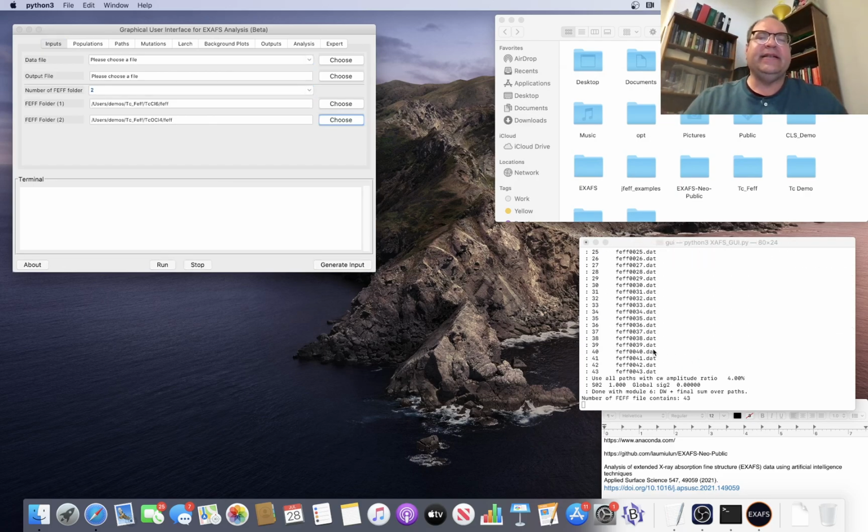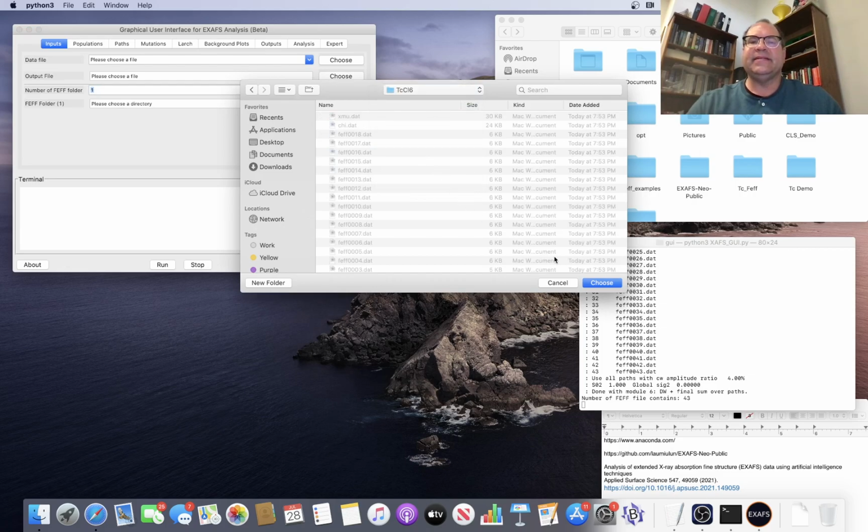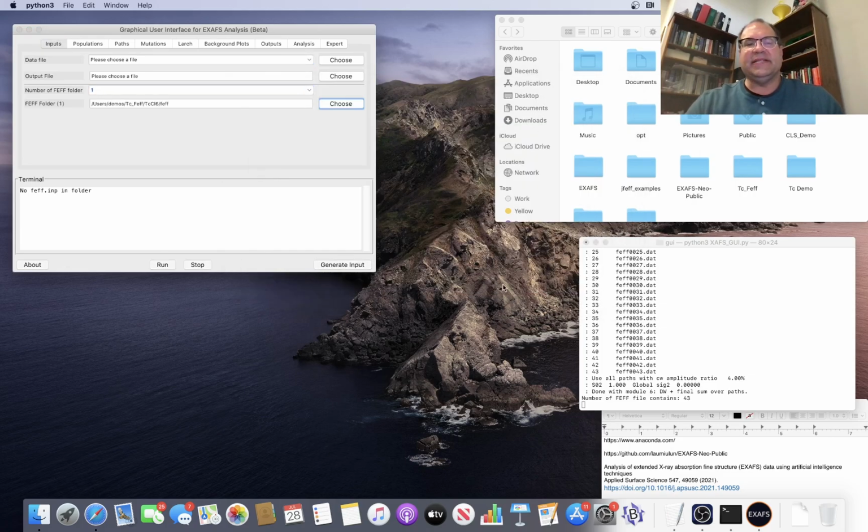Now let's say I decide I really know my material is TcCl6. I can go back here and make this 1. Have to choose my directory again, TcCl6. But this time it realizes that the calculation has already been done and doesn't repeat it.